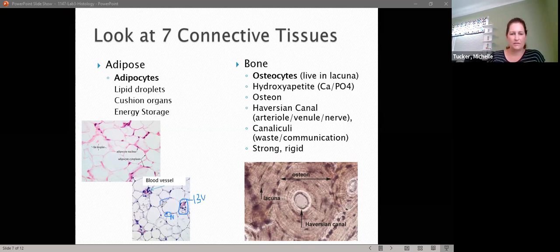This is a single cell right here that belongs to that nucleus. Inside is lipid, it's oil, and it is pushing out on the cell membrane. So it gives it a very spherical look. All of these cells are spherical.